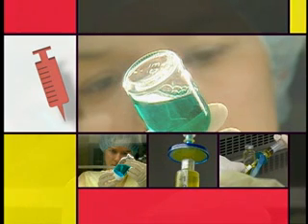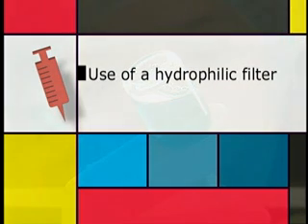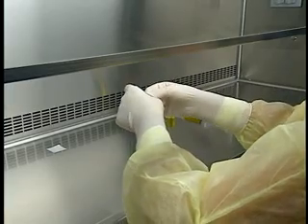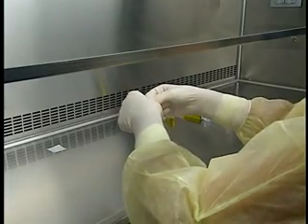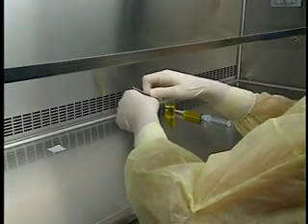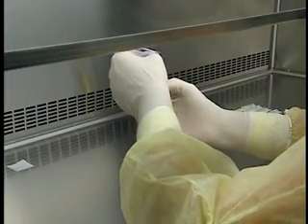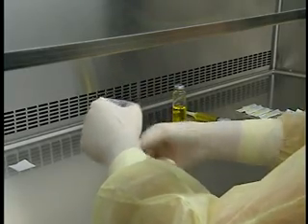Let's see how to filter a potentially contaminated solution. Hold the plastic dome containing the filter and grasp the disc firmly in the hollow between your thumb and index finger so that you can still use your thumb and finger for the manipulations. Open the wrapping taking care not to disrupt the laminar airflow over the filter.